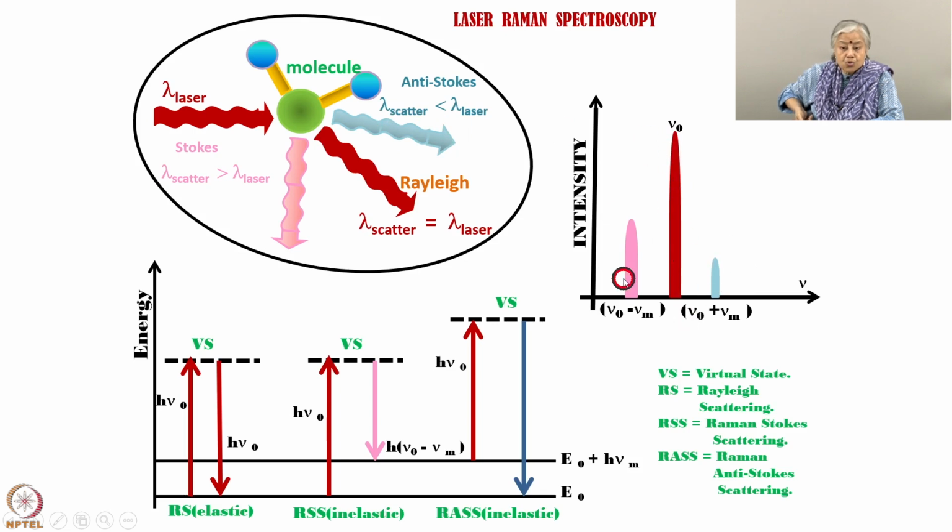So, you get two, on your CCD camera or your detector, you see 3 signals. Now, you have to decide which one is more important for you. Generally what is seen is this signal is huge. I have just shown it till here.